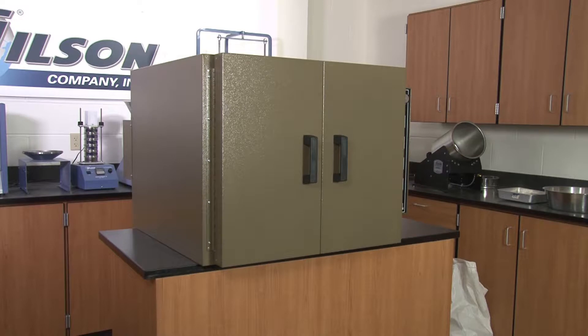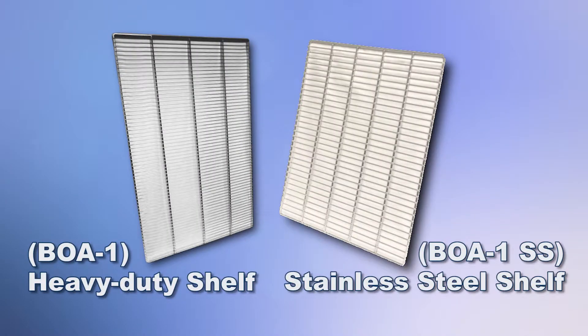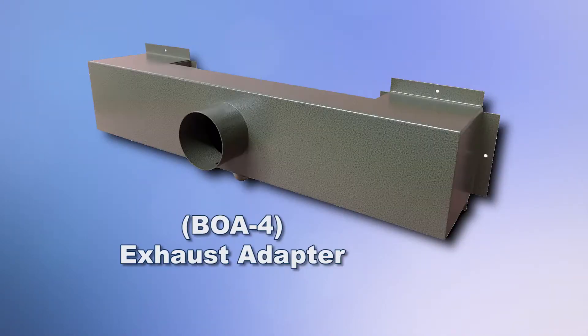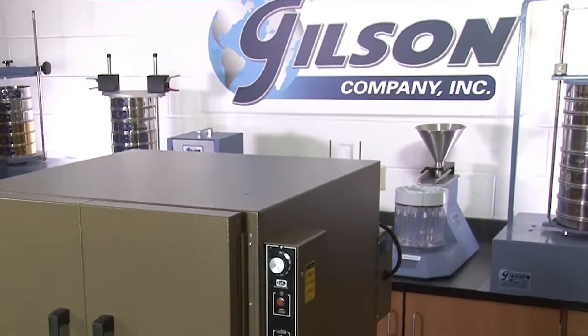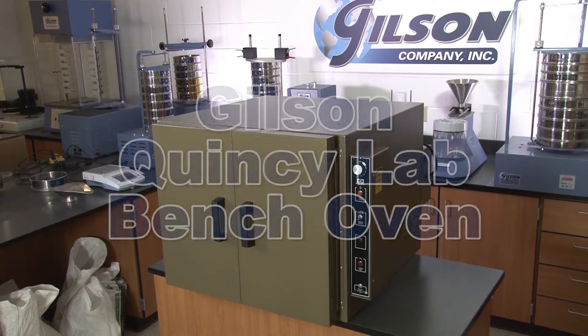All ovens are fully tested and calibrated before shipping. And with Gilson's oven accessories — including heavy-duty and stainless steel shelves, floor cabinets and stands, exhaust adapters, and a full range of thermometers and timers — the Gilson Quincy Lab Bench Oven is the right choice for your material testing lab.